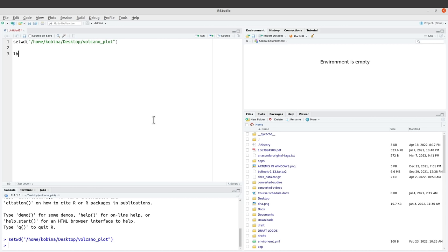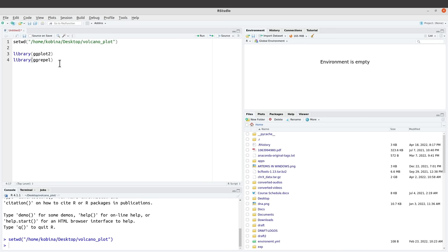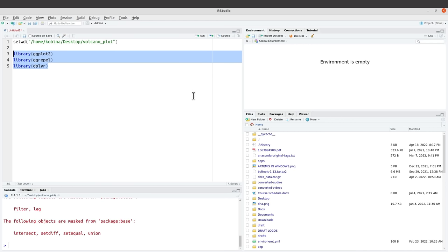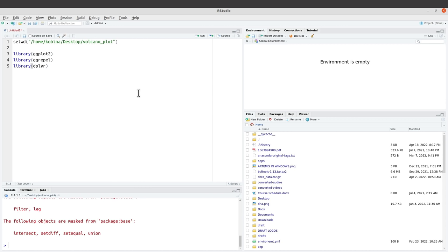Now I am going to load the libraries we will use. I'll start with ggplot2: library(ggplot2). Let's also load ggrepel, and then load dplyr. We'll run them to get them loaded. They have been loaded nicely for us.